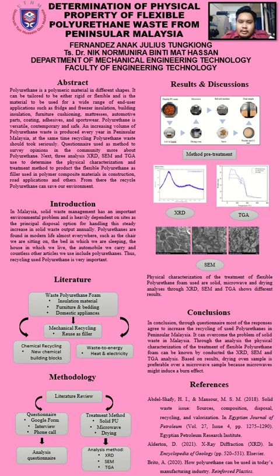So next is the conclusion. Okay, in conclusion, through the questionnaire, most of the responses agreed to increase the recycling use of PU in Peninsular Malaysia. As we know, it can overcome the problem of solid waste in Malaysia. Through the analysis, the physical characterization and treatment of the sample PU foam can be known once we conduct the XRD, SEM and TGA analyses.